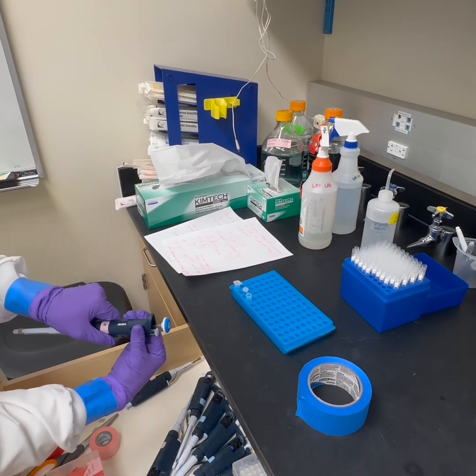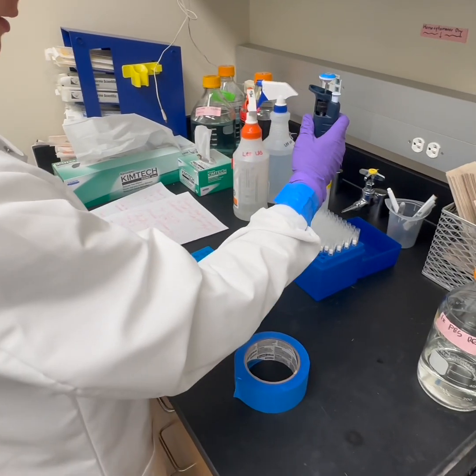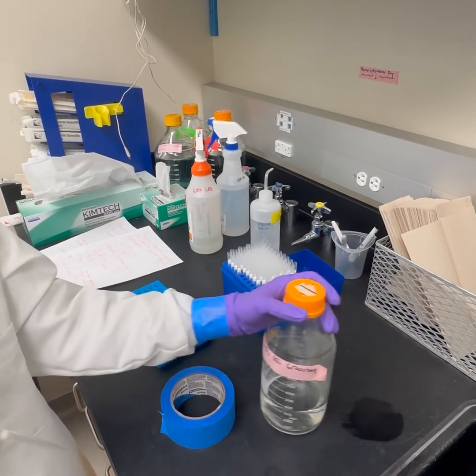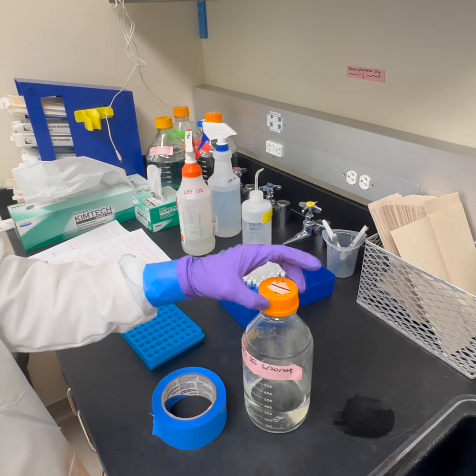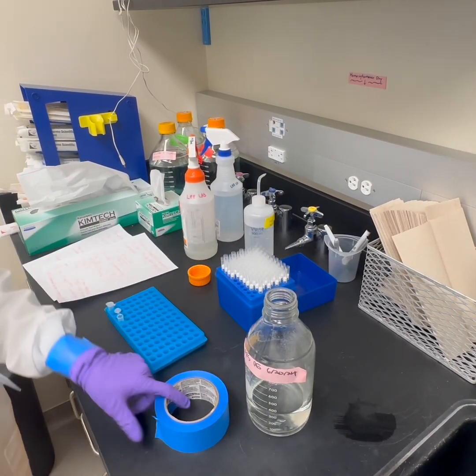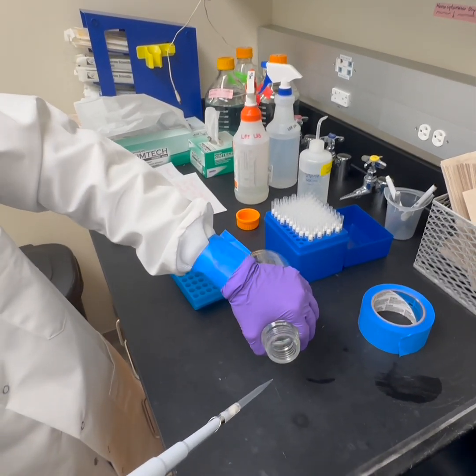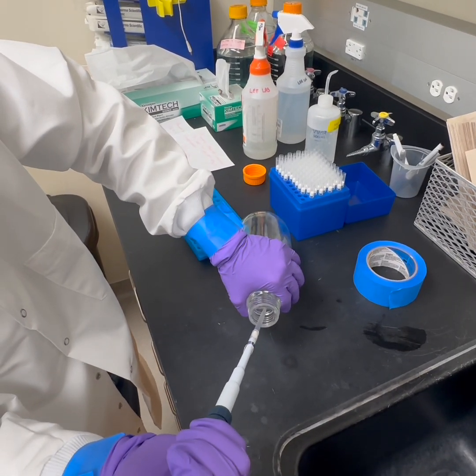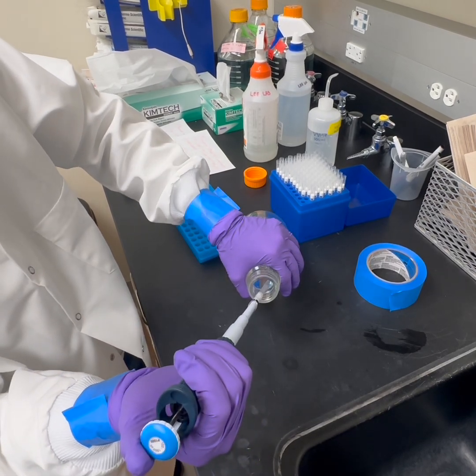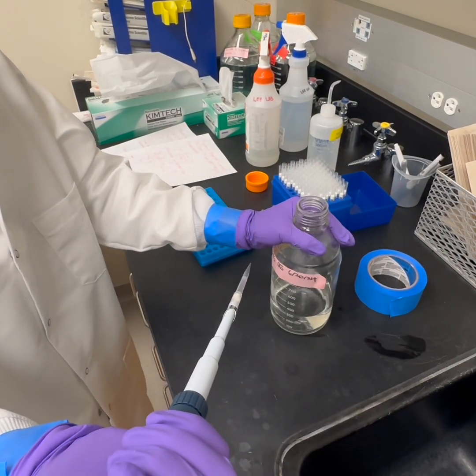So I'm going to grab 500 microliters of PBS. That's what we're going to be diluting in. You can do PBS or RPMI, doesn't matter. Avoid putting the pipette into the stock solutions. So what I'm going to do is tilt it so that I don't actually have to stick the physical pipette in, only the tip is in there. So you see I got 500.